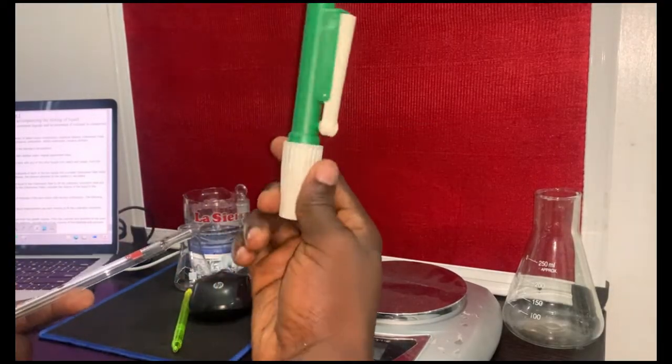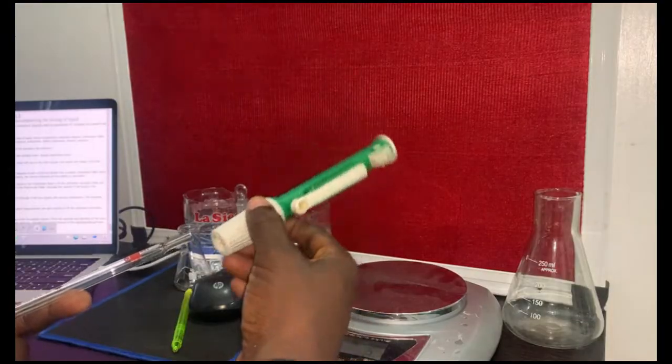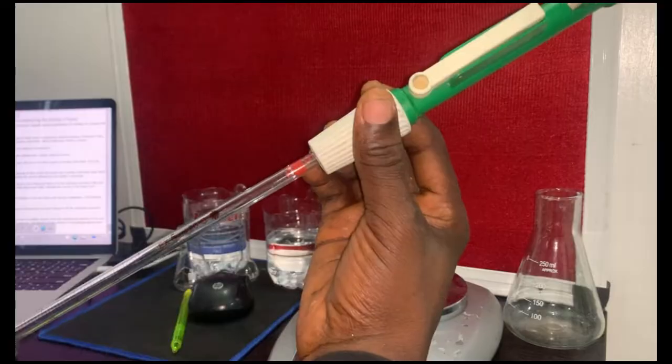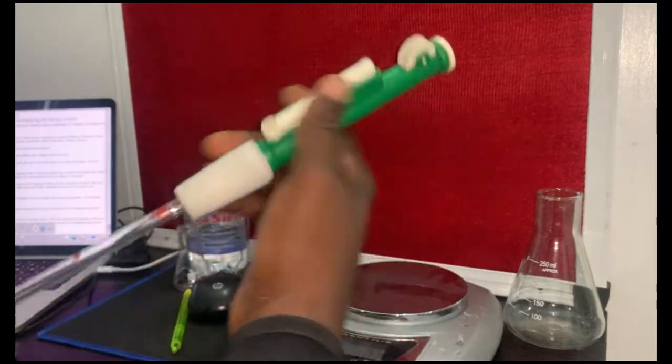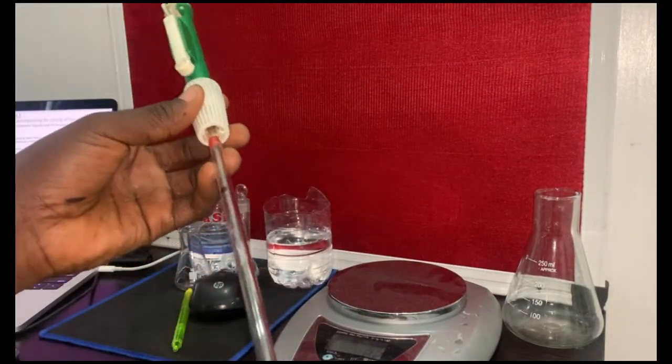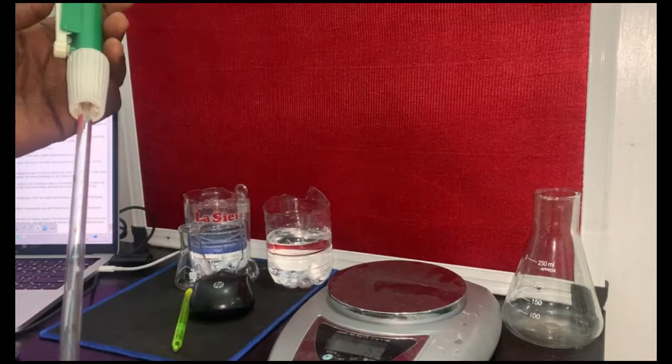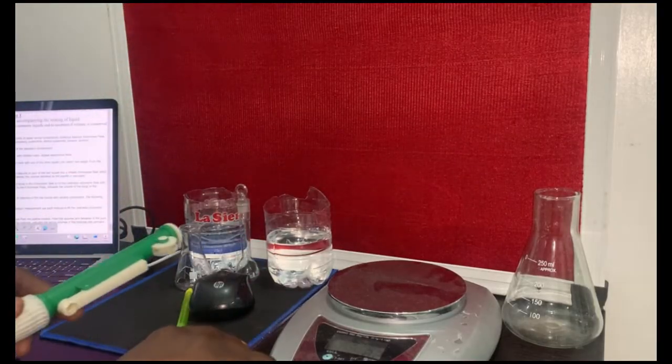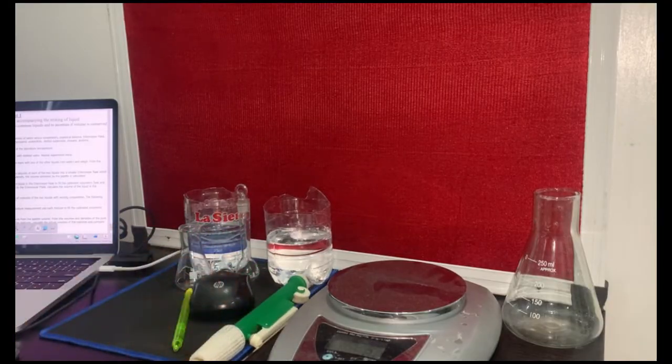These are my personal property. I bought it from the store. But in the lab, I think they can give you something similar to this, or something that will help you pull the liquid into the pipette without having to suck it through your mouth. Okay, so that's just the rundown of the apparatus and the reagents we're going to make use of.